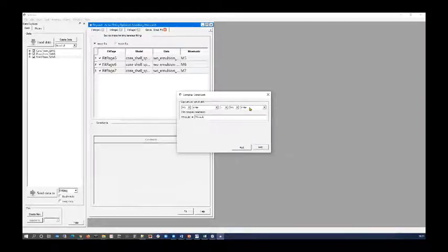Sometimes you might want to think carefully about what you use as the parent. In the interests of time, I'm just going to go with whatever is in fit page 5, which of course will be model 5. To start with, I will tie the scale together, because I'm such a good chemist that I've managed to make the volume fraction in all 3 samples exactly the same. Whether that's true is another matter, but we'll start with that.